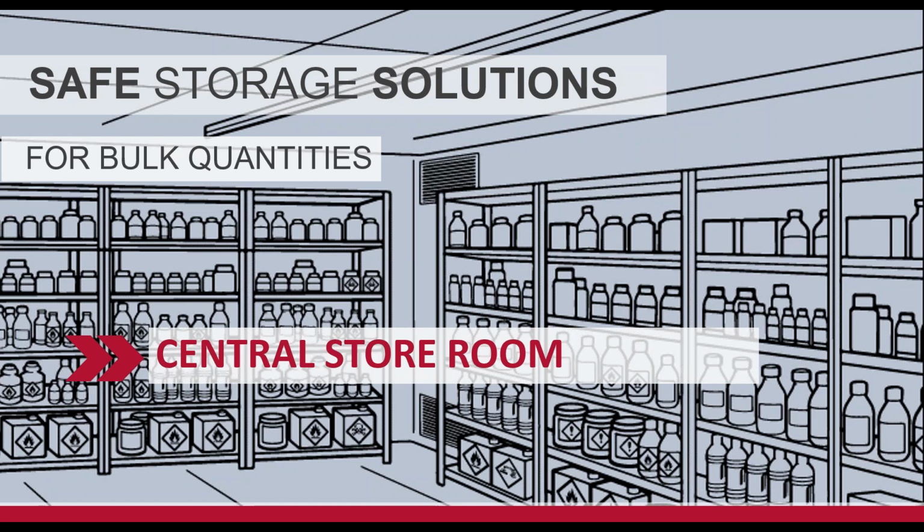The elevator's not safe. The pedestrian corridor is not safe. Any place that they go between that has typical air changes certainly is not made for spills, breakage, or just overall influx of the nasty air. So efficiency goes away. It's not as safe, and ultimately that's really the way we do it. There's other ways to do things.